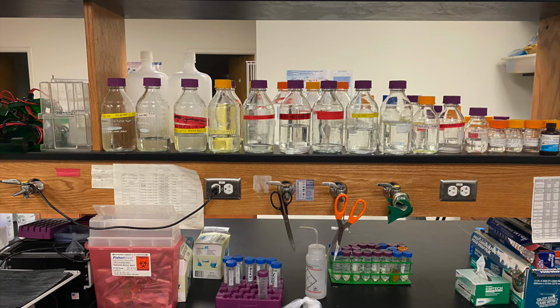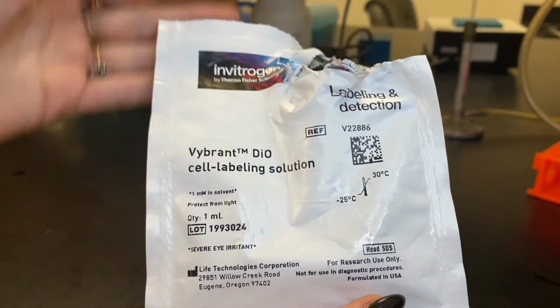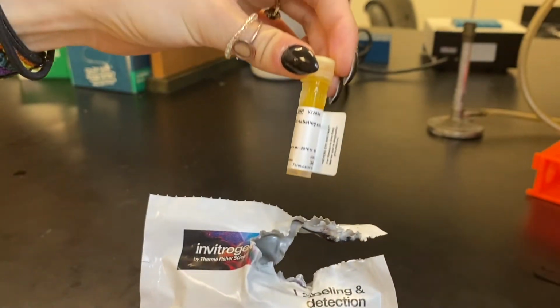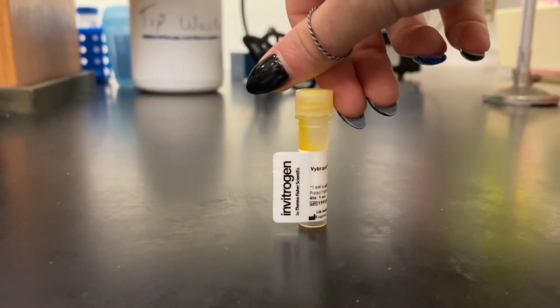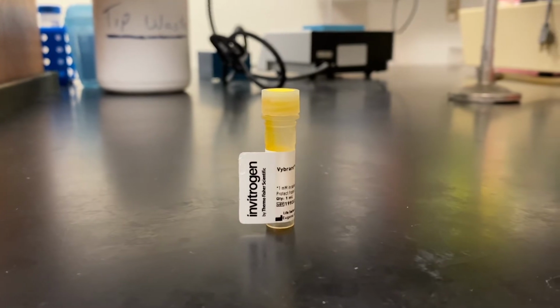So with that, I'm ready to take a shot at doing it on my own. DiI stains can be bought as a solution, paste, or solid crystal, and it comes in a variety of fluorescent colors, such as red-orange, far red, or even green. The DiI available to me is actually DiO solution, which means that it will fluoresce green, but I'm going to continue referring to it as DiI throughout the video since that's the standard.